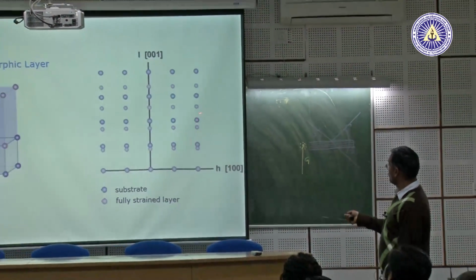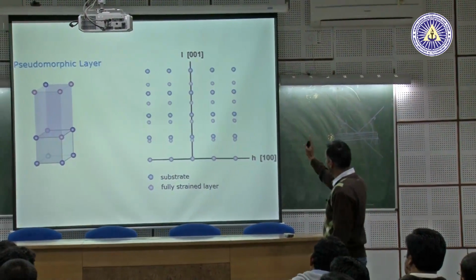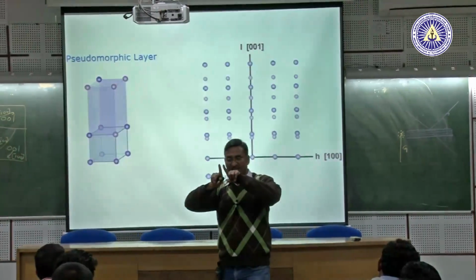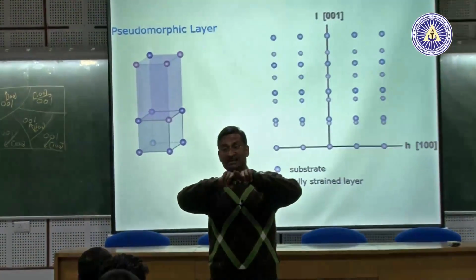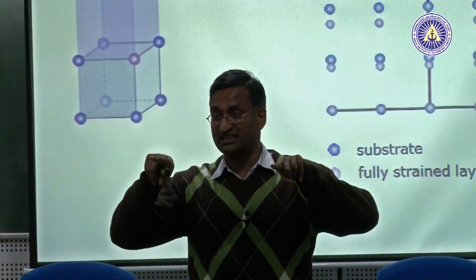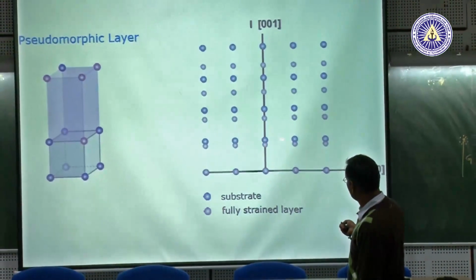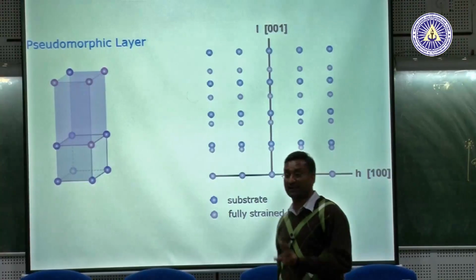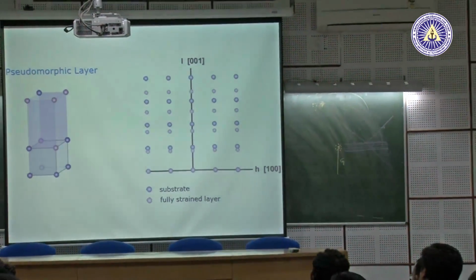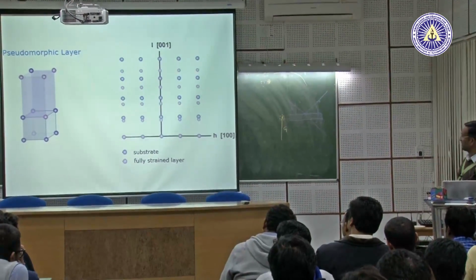So, if you are able to draw these 2D maps theoretically, what does this tell you? It tells you first what the strain level is by measuring the spacing between the 2 points, and by measuring the exact location of the 2 points, you can calculate the exact d spacing and the changes in d spacing. But you will have to do that not only for the symmetric spots, but also for the asymmetric spots to get a complete picture of the different strain contributions to the sample.